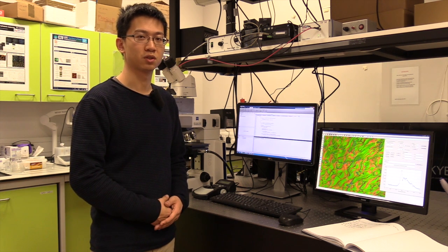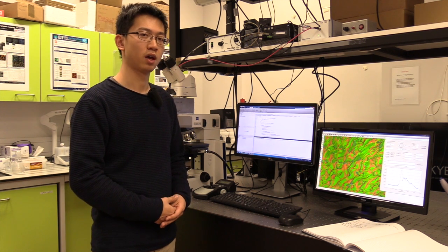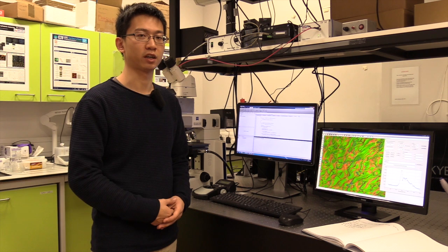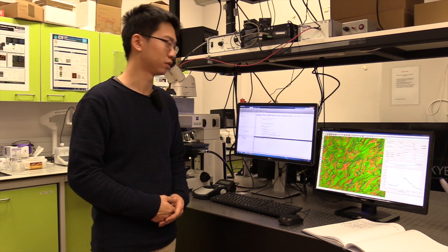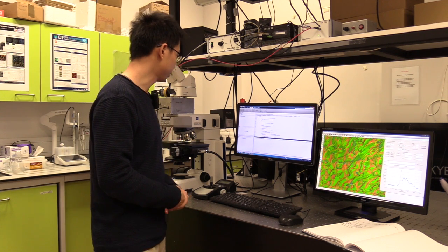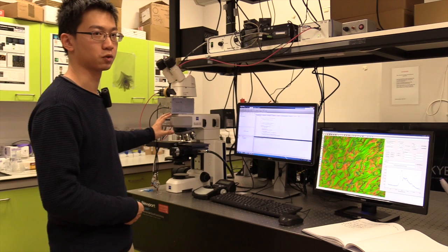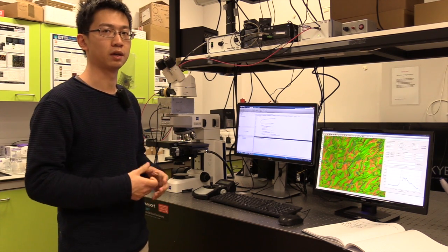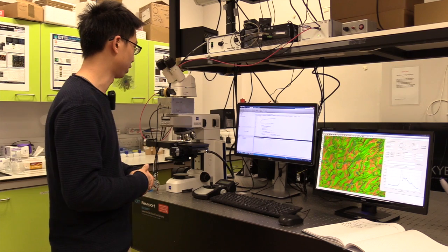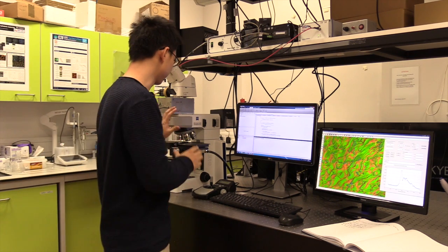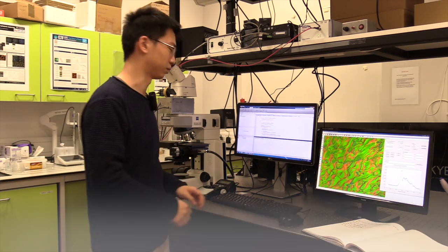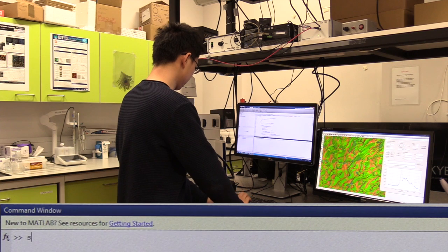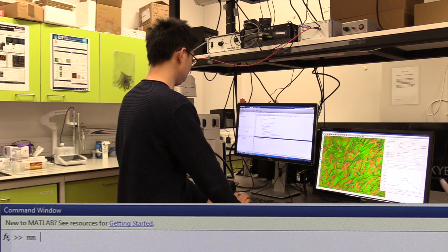Hello, I want to introduce the software package I made for making data captures in multiple dimensions. As you can see here, we have a motorized microscope. To begin with, it's very easy to initialize the probe. Since it is a motorized microscope, just type in mm equals motorized microscope.